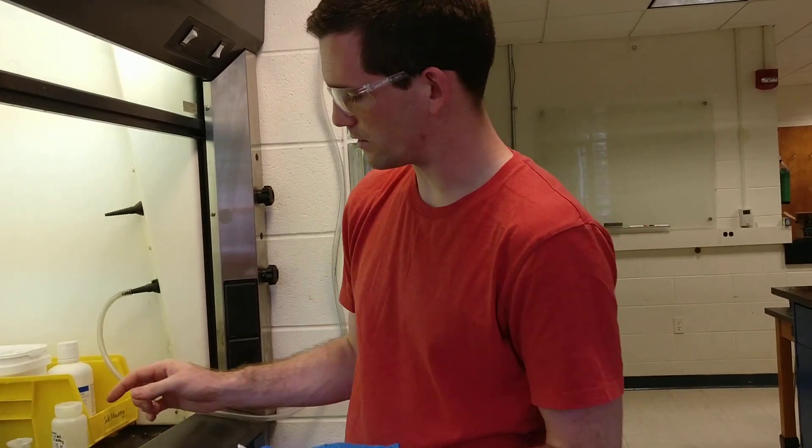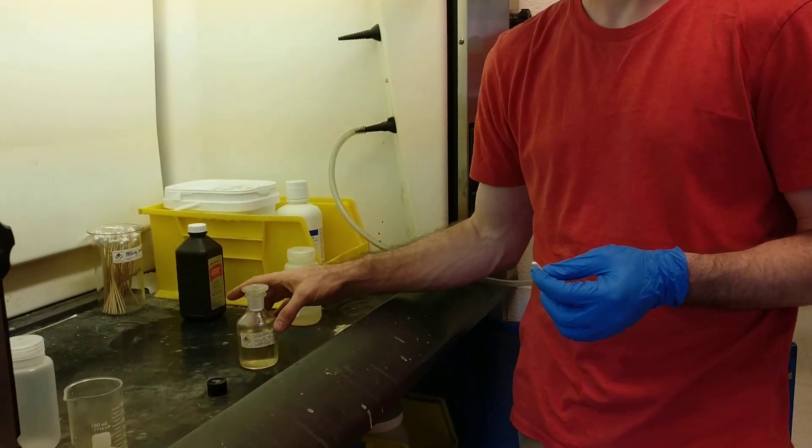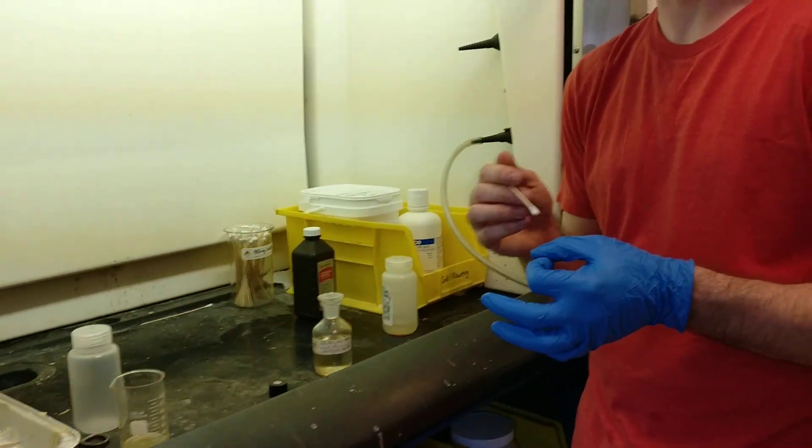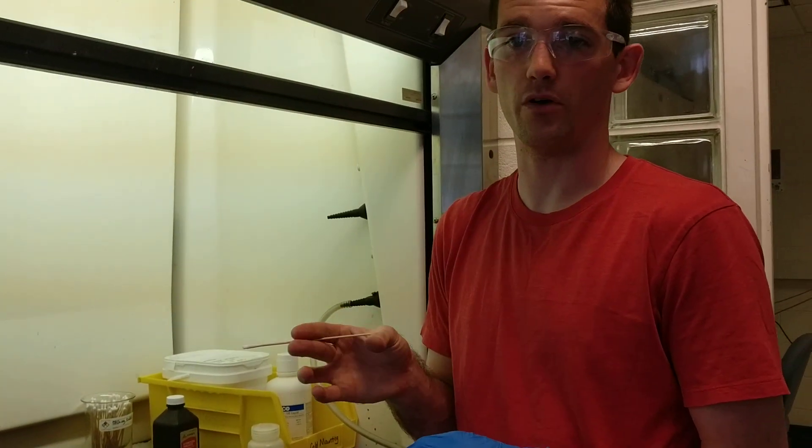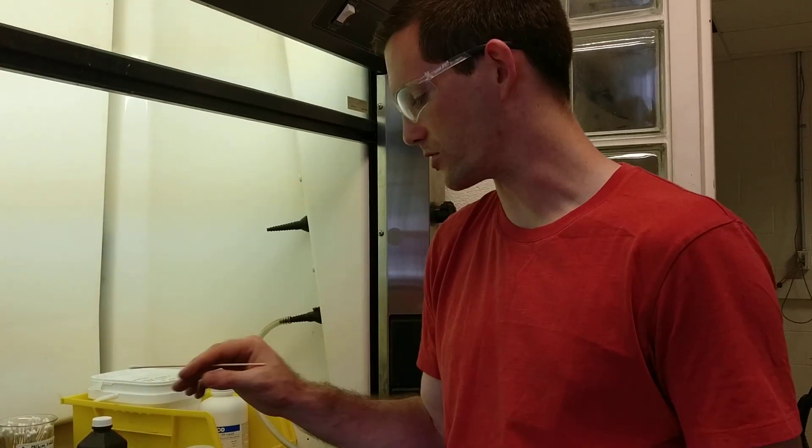I'm loosening the swab because my etch is mostly alcohol, and as I swab, if that alcohol evaporates, I will stain the sample, and you'll see rainbow colors in the optical microscope if that happens.